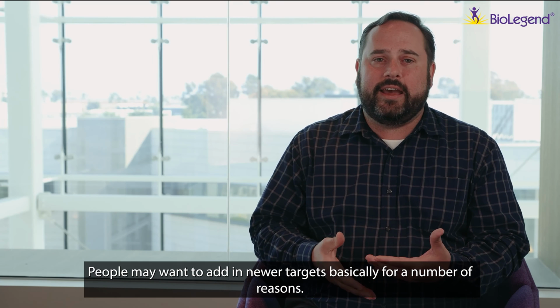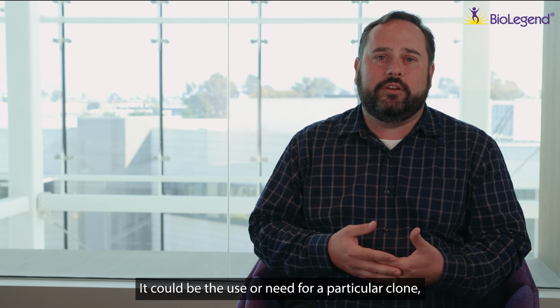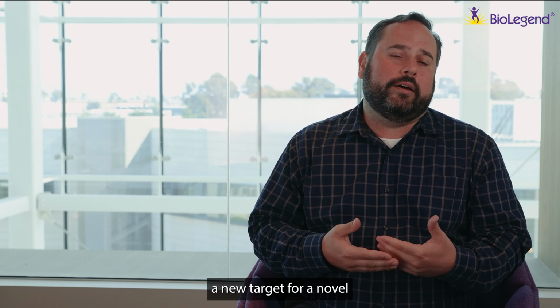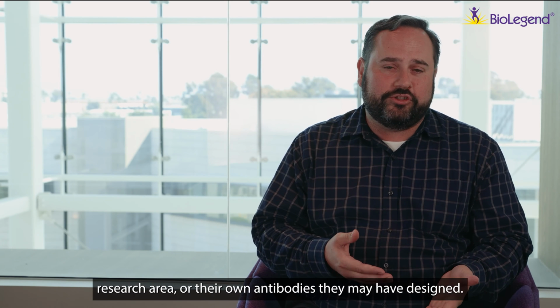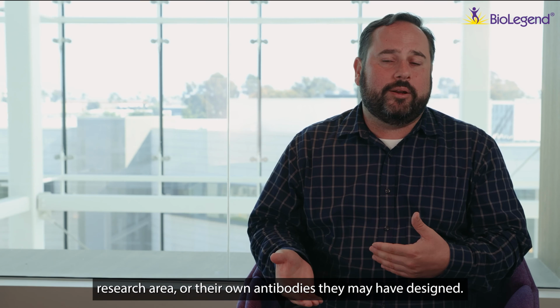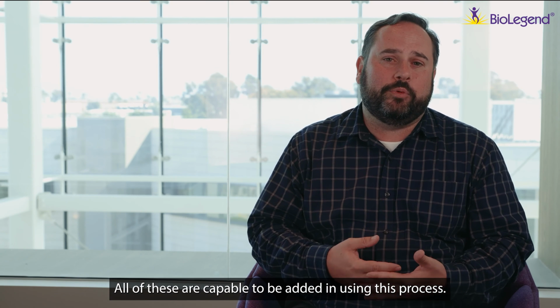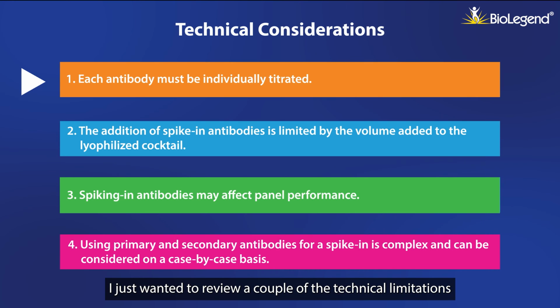People may want to add in newer targets, basically for a number of reasons. It could be the use or need for a particular clone, a new target for a novel research area, or their own antibodies that they may have designed. All of these are capable to be added in this process, and I just wanted to review a couple of the technical limitations in that regard.